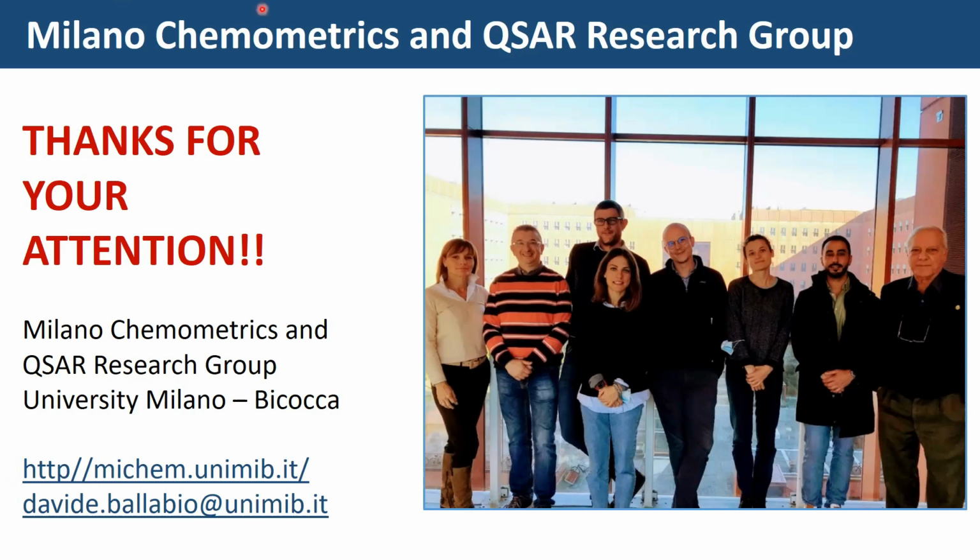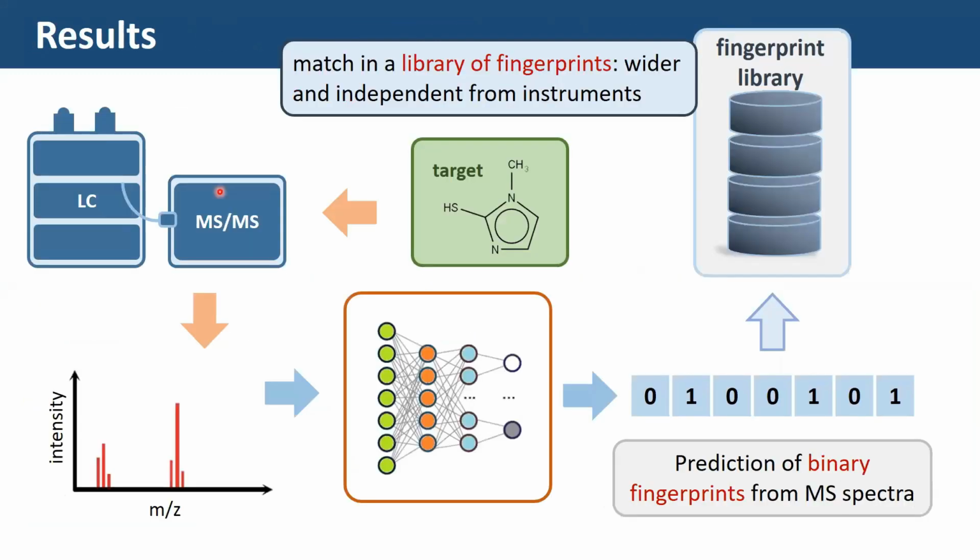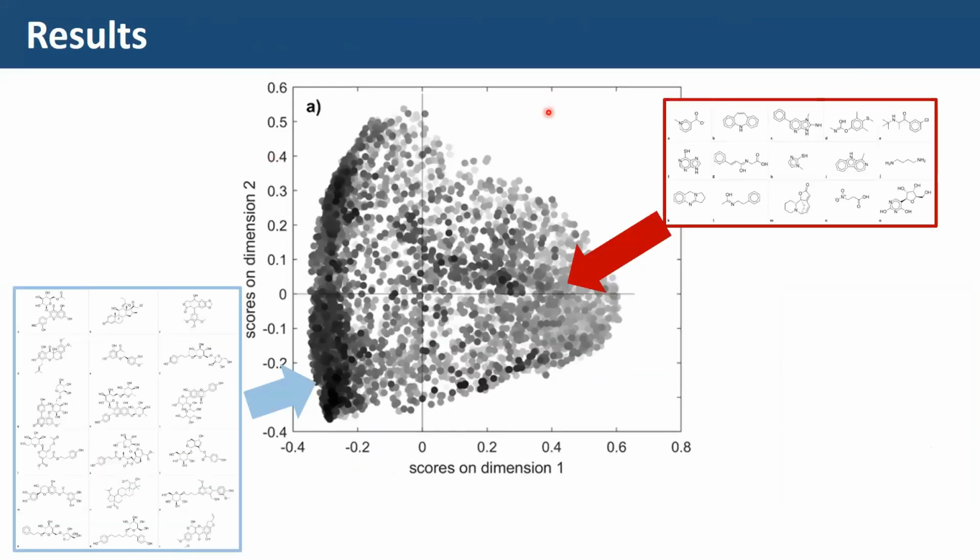Okay, the first one is from Stanstrup, who asks whether this seems to be similar to what they are doing in Sirius CSI:FingerID. Okay, so all structures predicted badly to the right contain N and sometimes other heteroatoms, while the others are mainly polyphenols. Could be.